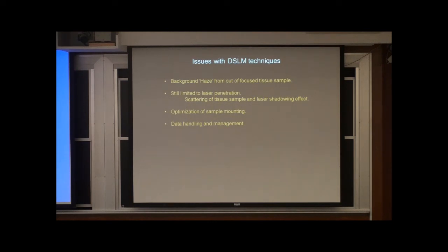And still these techniques are limited by laser penetration. The laser can't penetrate more than a certain depth, depending on tissue type. It also has a laser shadowing effect, which you might have noticed in a few of the images. It is also very much dependent on sample mounting, because two objects have to come very close. So your whole machining and geometry is very important.